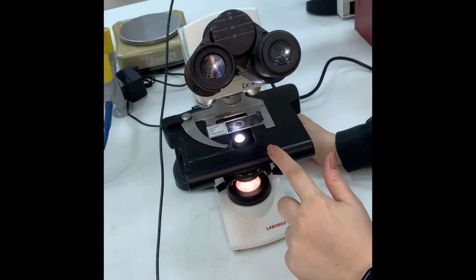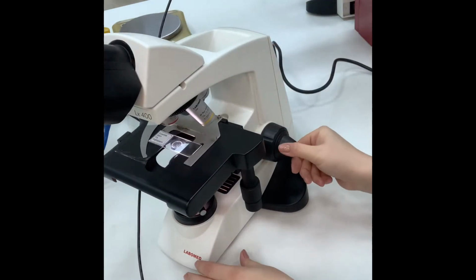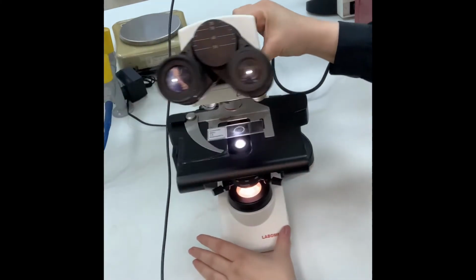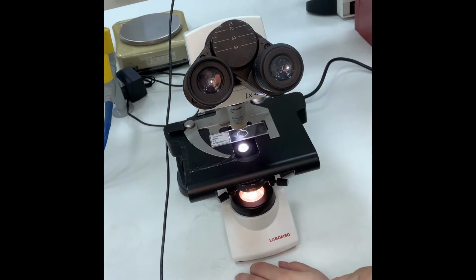Once you see the image, you will stop, even if it's unclear, and you will sharpen the image by using the fine focus. And from there, you can look at the image, you can draw it, and then if you need to go for a higher magnification, very simple.